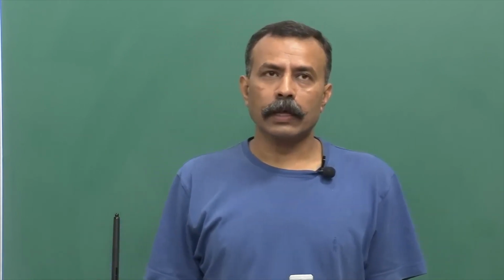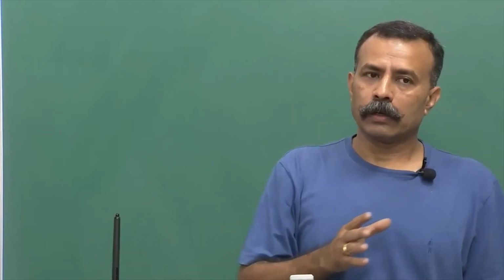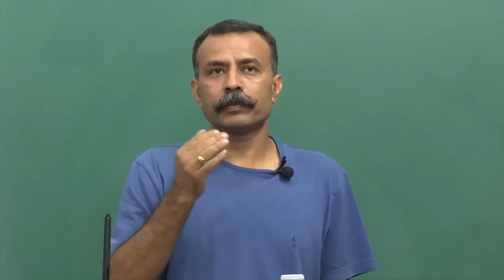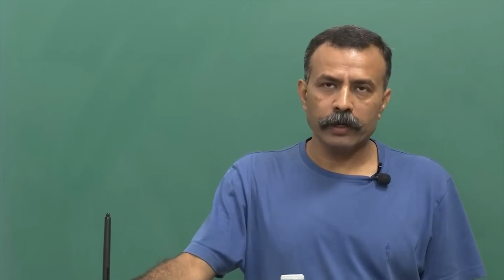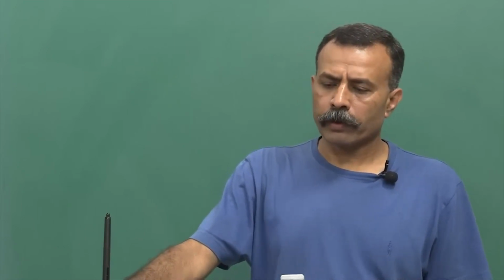So, in the last class, we walked through a virtual lab, which I wish most of you develop someday. So, what are the points which have to be kept in mind in the whole layout and the budget constraints that you face?